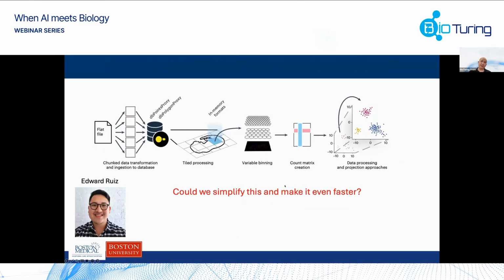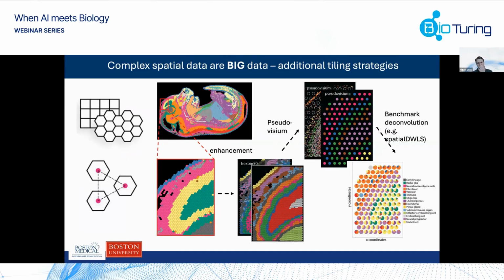And the base data is Xenium, right? This one is Stereo-seq, but I showed it previously with Xenium. You can create the pseudo-Visium with any type of subcellular data. It just helps you to create Visium data with a ground truth if you have that information available. Yeah.